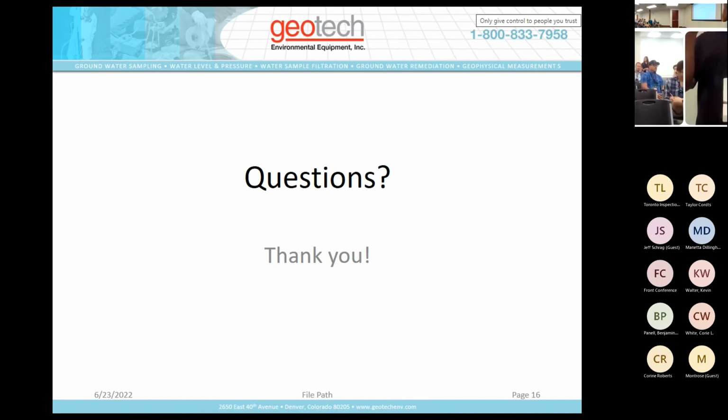We have clients that have both, which makes it nice and easy because one's white, one's blue. On our PES filter, the arrows are a different color depending on which one's a high capacity and which one's a medium capacity too. Okay. Yeah, I've used a bunch of those, and I was just curious what the difference is.